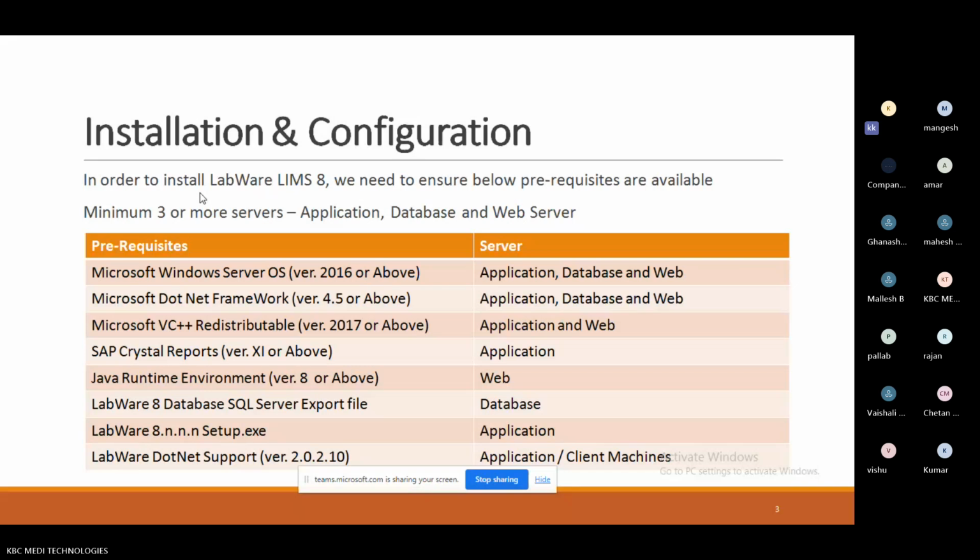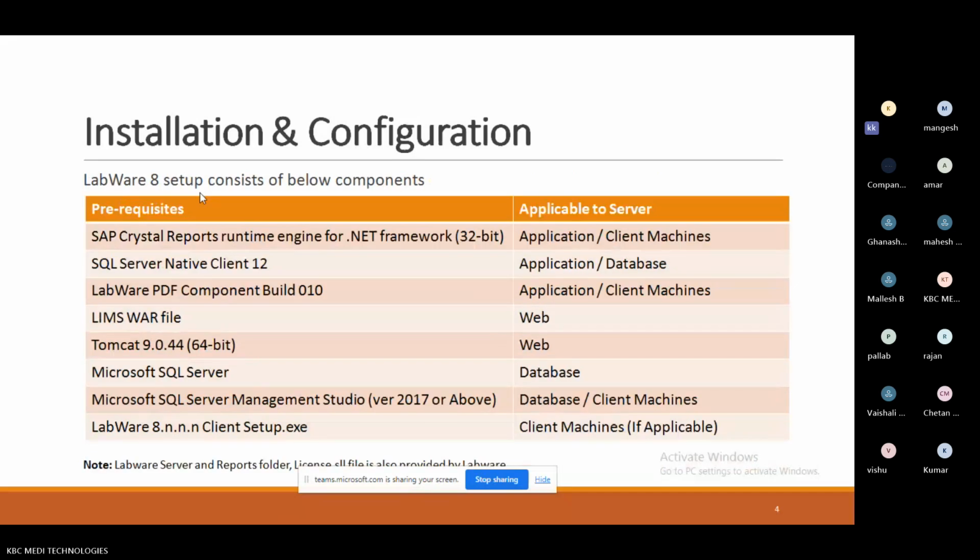with the further installations. After making this setup, you need to do some customizations also, like Tomcat and Microsoft SQL Server as I communicated, and SLL files, the way you want to run the application. This SLL file indicates your licenses, and the complete information will be there. I am just giving some basic information. However, each point I am going to discuss briefly during the real-time training.